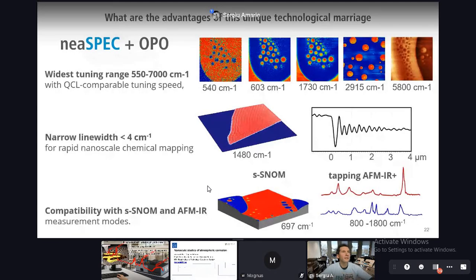Very good question. It is possible to run nano-AFM-IR in a liquid environment. There are studies out there using liquid environment, with ASNOM and nano-AFM-IR related sub-micrometer scale methods. I don't know if you are on the emailing list of the Journal Club. The last Journal Club, just last week, presented a related topic, nano aquarium, where live cells were measured with this technology.